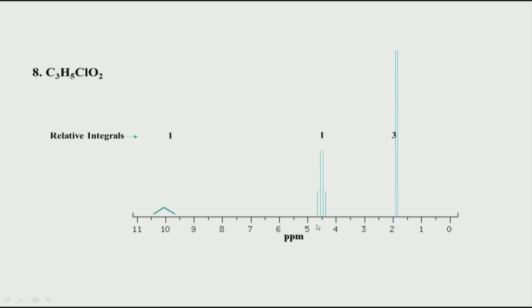And look at the chemical shift value, it is coming between 4 and 5. That means it could be directly attached to oxygen or to a halogen, C-Cl or C-O. Remember, halogen C-Cl or C-O or C-N all have downfield shifted values. So, before we see the final answer, let us try to work out what the structure could be.